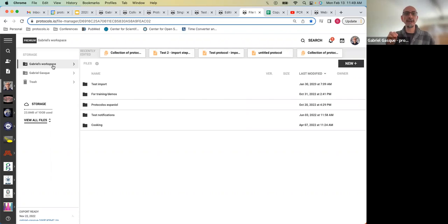You cannot restrict access to specific folders to specific users of the workspace. However, every user of the workspace has a second folder, which you might see has a raccoon logo. That's a private folder that only the user can see.